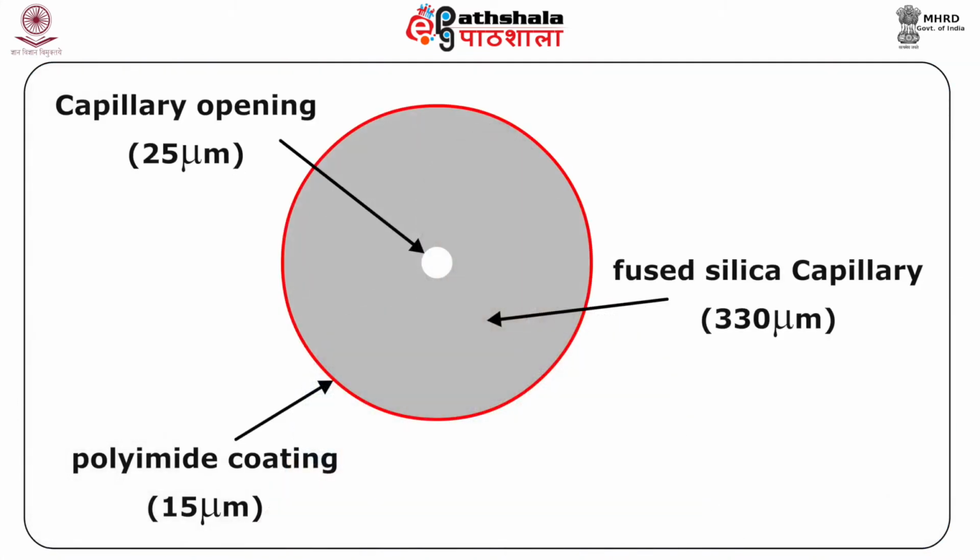In capillary gas chromatography, there are capillary columns which are thin fused silica, that is, purified silicate glass capillary, with a stationary phase coated on the inner surface. Capillary columns provide much higher separation efficiency than packed columns, but are more easily overloaded by too much sample.